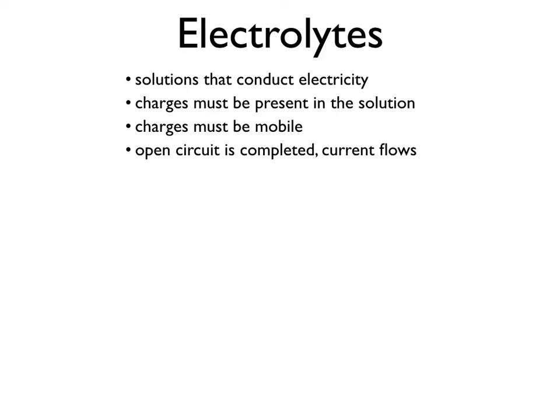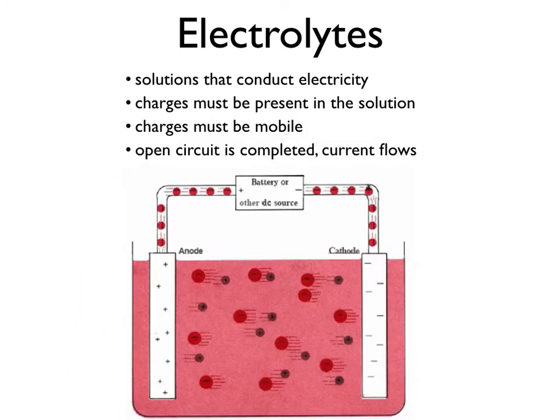And in the lab, you didn't have a light bulb, but you had a tester that connected to your LabQuest, and you could actually see the amount of electricity being conducted by the circuit. Here in this diagram, you can see why that's happening. You can see the two wires that are dipped down into the solution have a positive or negative charge coming from the battery.